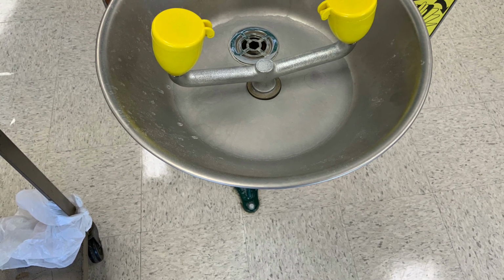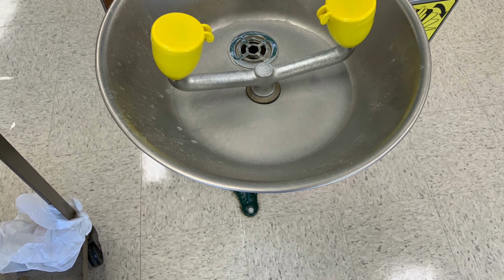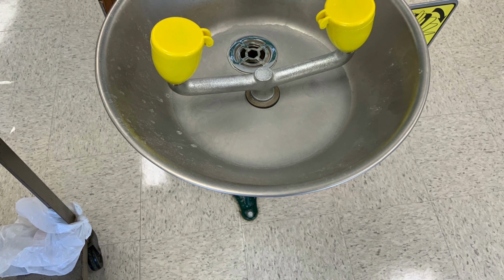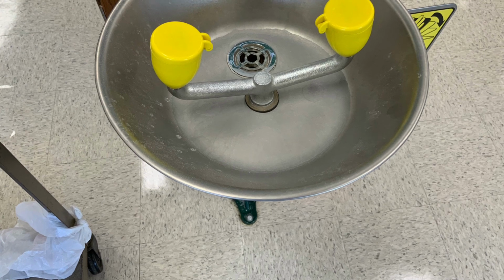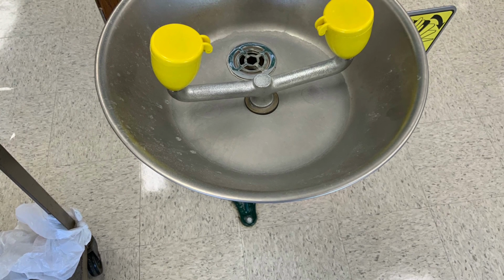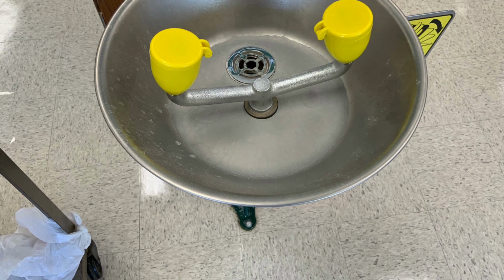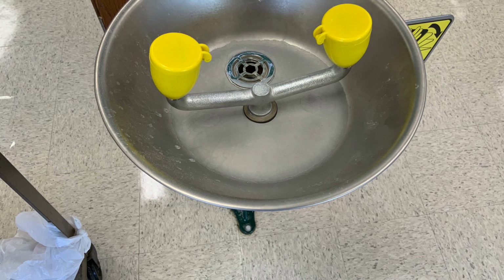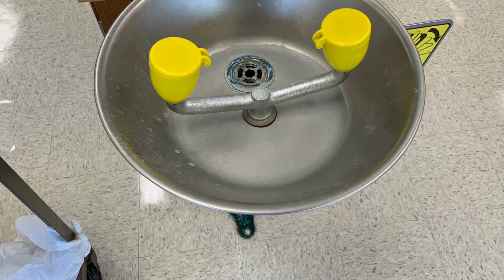Up next, we have the chemical eye wash station. This is used for when somebody gets any potentially harmful chemicals in their eye, and it needs to be cleaned out immediately before it does any damage. You go over to the chemical eye wash station, you open up the yellow things that are protecting the water from coming out, and then you pull the lever, and the water comes out, and you just look down into it, and the water rids your eyes of any harmful chemicals.